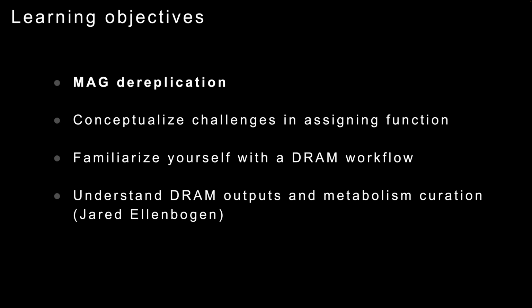Okay, so the learning objectives for today. I'm going to first talk about MAG dereplication. Then we're going to talk about annotation in general and the idea of annotation. Then we're going to talk about the DRAM workflow and how DRAM actually does genome annotation. And then we're going to switch places, and Jared's going to talk to you about how to actually infer function from genomes with your millions and millions of annotations that you get from microbial genomes.